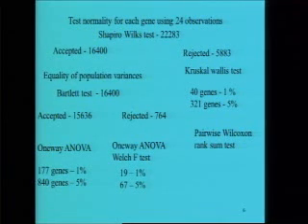So on these 40 genes or 321 genes which are rejected according to the Kruskal-Wallis test, we apply the pairwise Wilcoxon rank sum test to find out whether the gene has a different profile in which group. So there are three pairs of hypotheses that we have to test: mu1 equal to mu2, alternative mu1 not equal to mu2; second is mu1 equal to mu3, alternative is mu1 not equal to mu3; mu2 equal to mu3 and alternative is mu2 not equal to mu3. So these three pairs we need to test, and then the result is shown in the next slide.